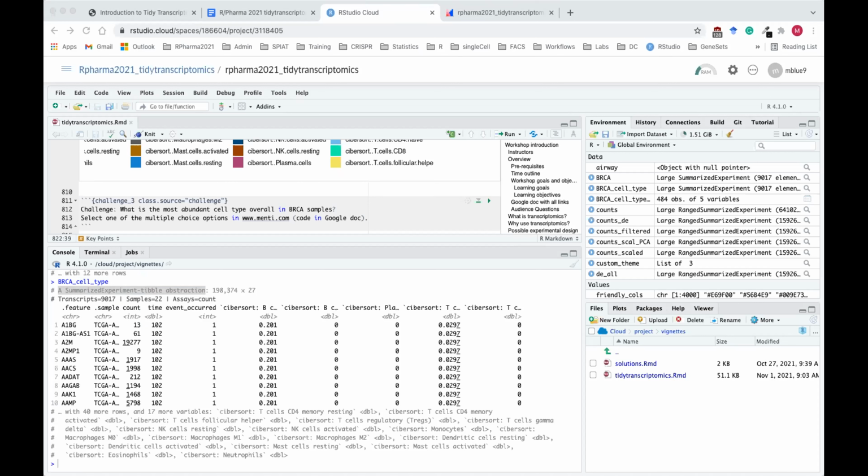And then is there a paper reference to show the sensitivity of differential expression by comparing this to EdgeR? The answer is most surely yes, although I don't know off the top of my head. These are very popular methods that have been developed years ago. I don't know if Maria, you know, off the top of your head, but there must be a review and benchmark that compare those two. Definitely, the answer is yes. Just a matter of looking for them.